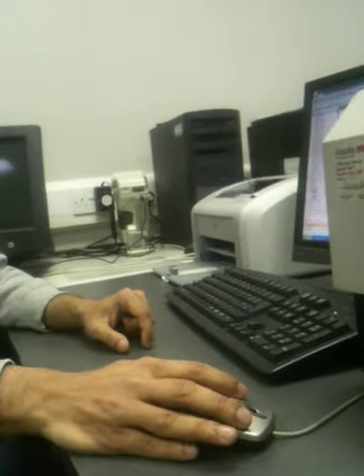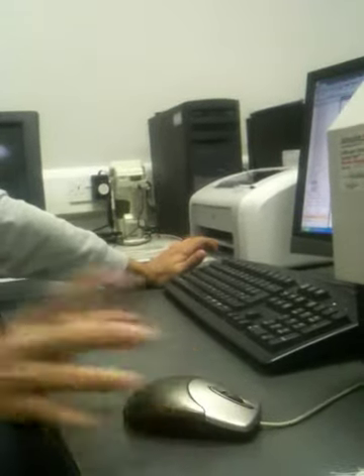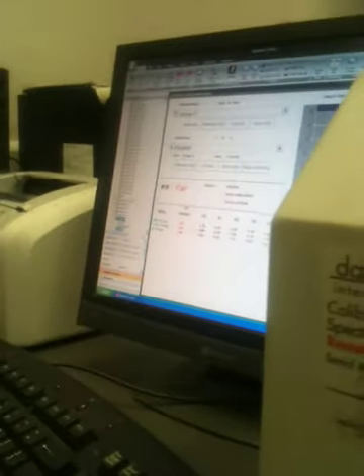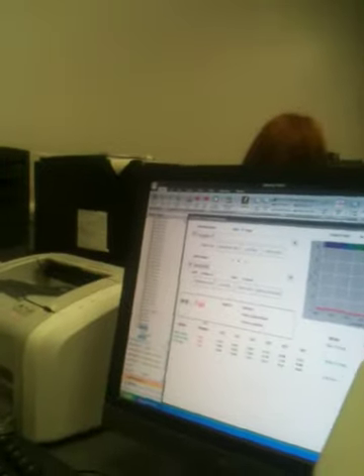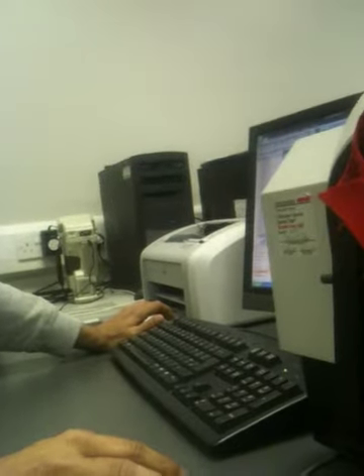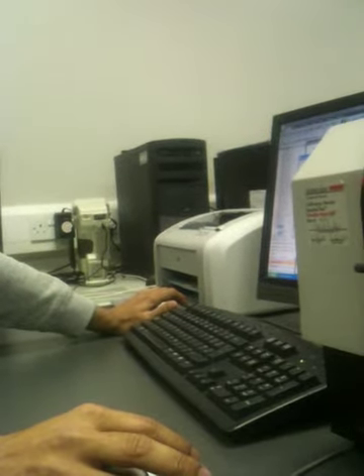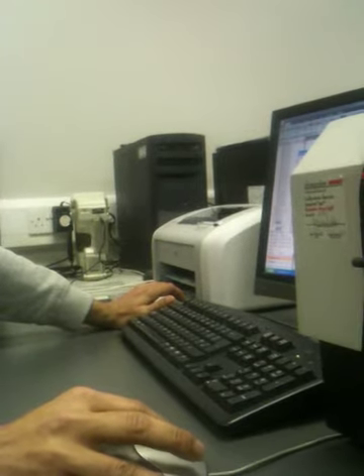Alright, this is not our standard, so it's giving you DE, that is the variation we were talking about. You are taking the pass or fail decision, right? Here it is basically a decision based on instrumental value, but because we didn't measure the standard, the data doesn't mean anything. Now, I don't know if we have the standard here. Let's see if they put the standard here.